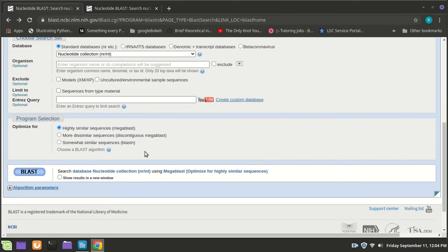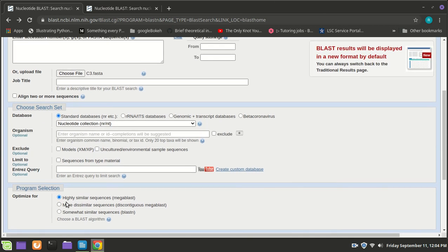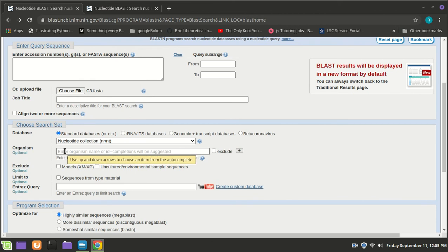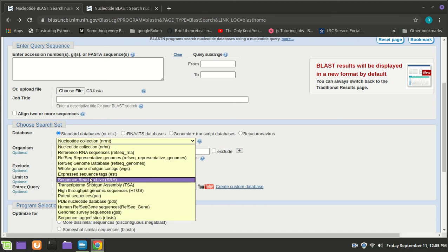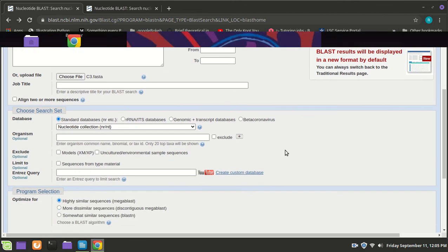But these are the things you can do with basic Blast. You can search. If you don't get any results, click on these. It'll change your results a little bit, be a little bit less stringent. So you can reduce the stringency in different ways by clicking on these, and you'll get something. Or you can alter the organism. You can choose just a specific organism you want to, or groups of organisms you want to search in. Maybe you're just interested in mice, so you choose, I just want results from mice. And you can also choose the databases that you search in. As it is, we searched in all databases. All right, and that's about it for basics of Blast.